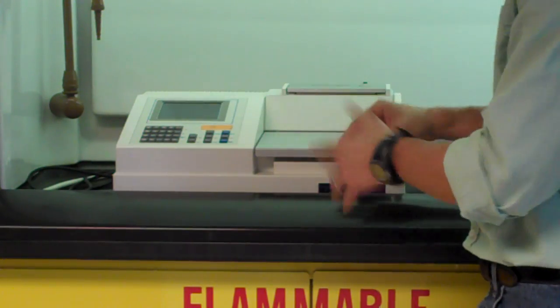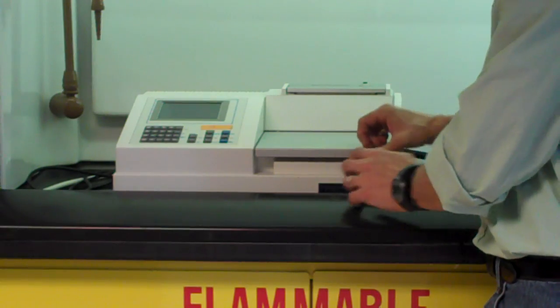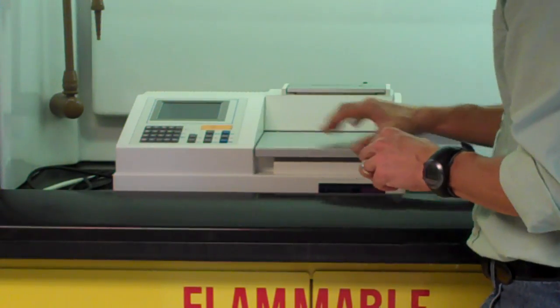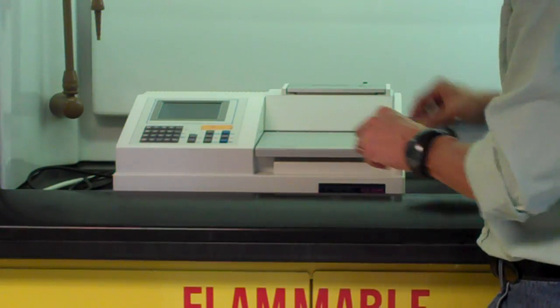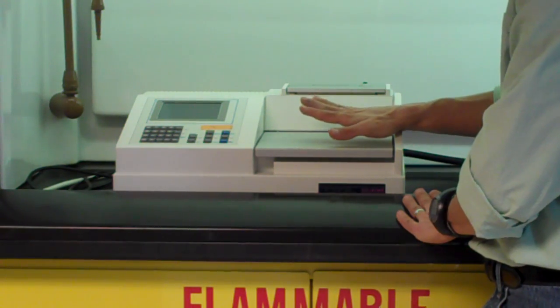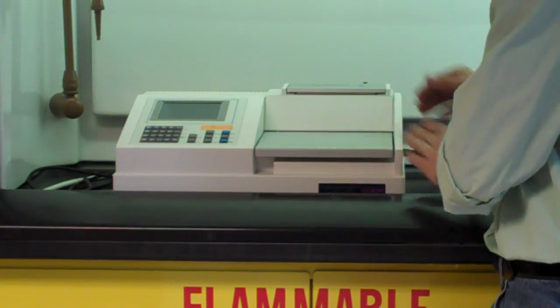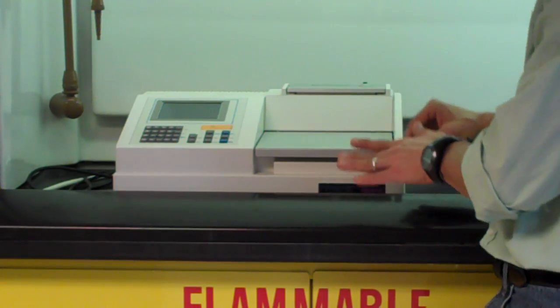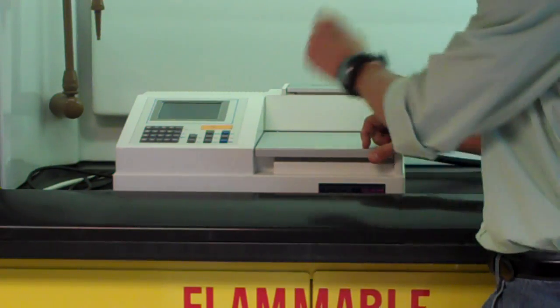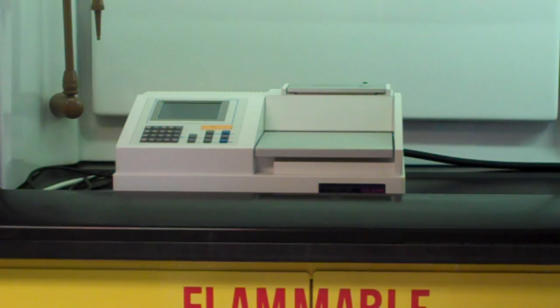So once you start your reaction, put the cuvette in here, it's ready to go. You simply need to put it in, take it out, because you might have to swap out your two cuvettes, or you may be sharing the spectrometer with another group in the lab. So be careful of handling the cuvettes so you don't spill them, but all you'll need to do once you start the reaction is take them in and out of the spectrometer.